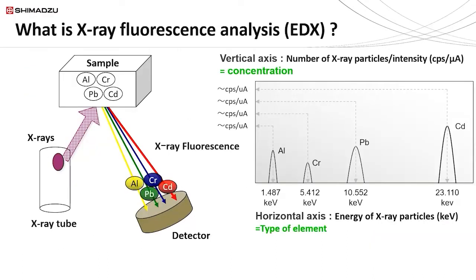So bear with me a moment. Maybe to some members of the audience this material is rather familiar, but it helps to understand at least the basics of X-ray fluorescence. X-ray fluorescence is an umbrella term. Let me start by saying that we need to be a little particular with vocabulary here.